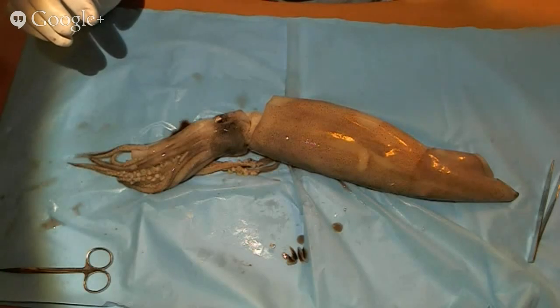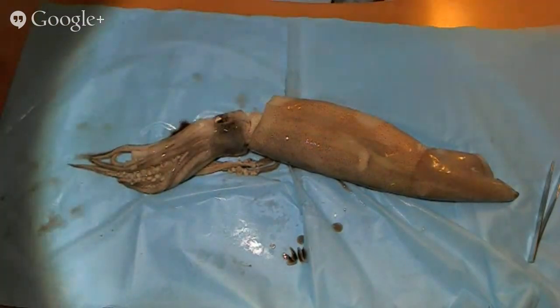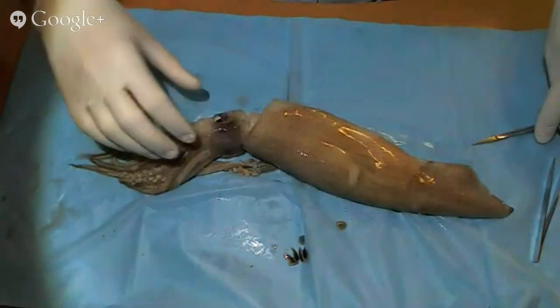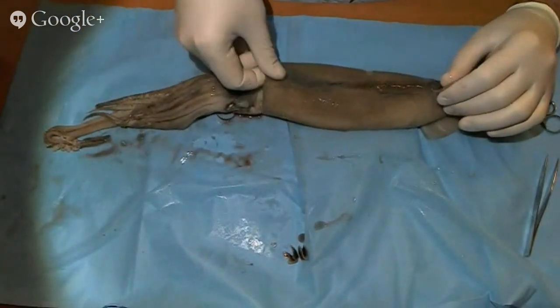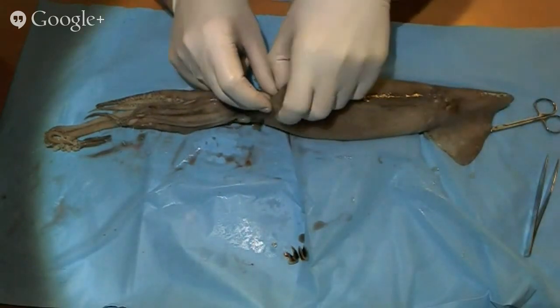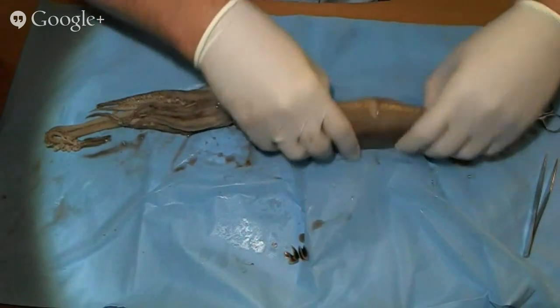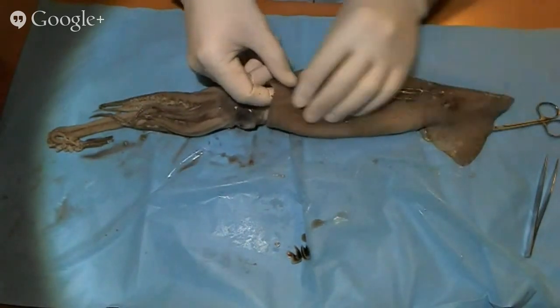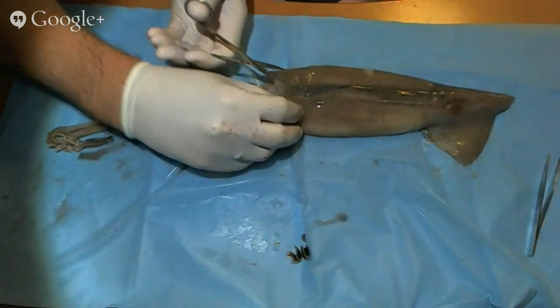All right. So back to here. Now, we're going to cut this open. We'll have a look at the inside of the squid. And I'm going to do this from the dorsal side. We'll see. A lot of times, what you can ask kids to do is pull out this sort of hard structure that's inside the squid's mantle, but it depends on the squid too, because some of them have different sources of these.